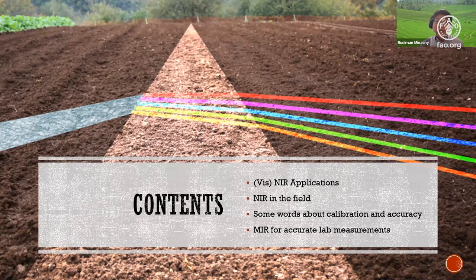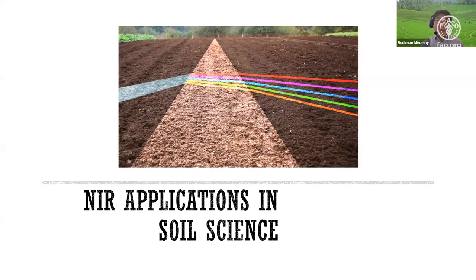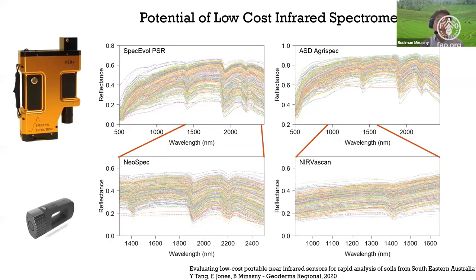And then some words about how we calibrate the infrared so that it can predict the soil data. And then lastly, I will talk about mid-infrared for accurate lab measurements. So let's begin. First I'll talk about the near infrared applications in soil science.